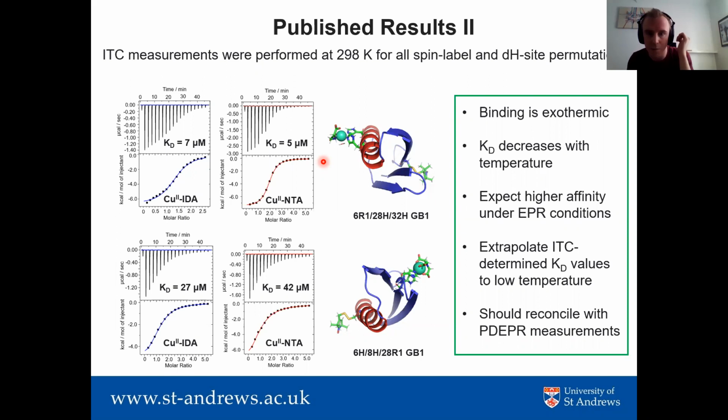Okay, then Thomas. Hey, thank you, Joshua. Great talk. Quick question. In solution NMR, when we measure PREs, we normally go over around 5 spin labels, gadolinium, manganese, nitroxides, just to see what non-specific binding is occurring, meaning labeling to protein randomly, like protein to protein.